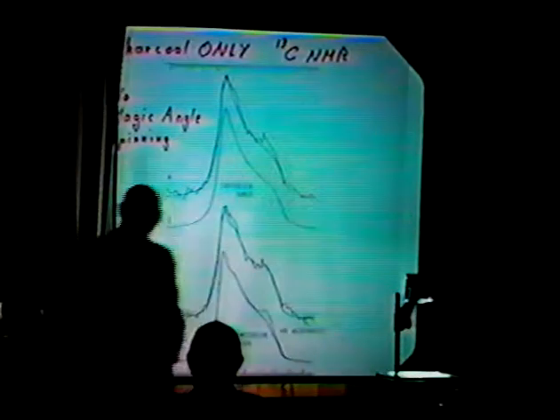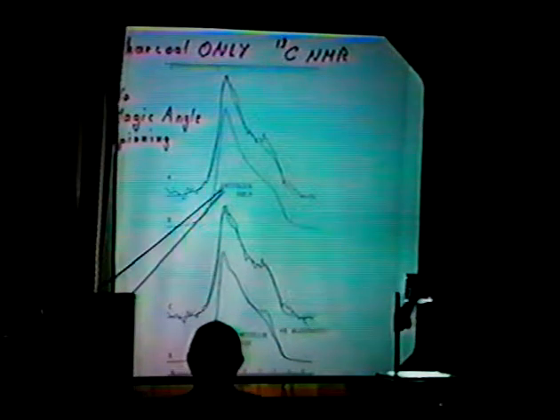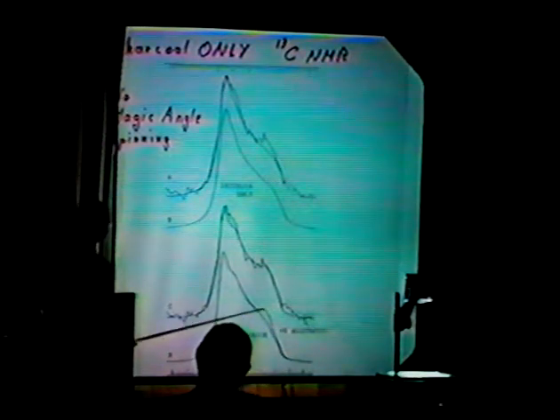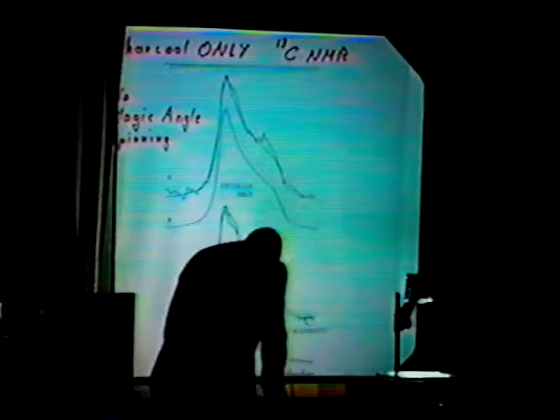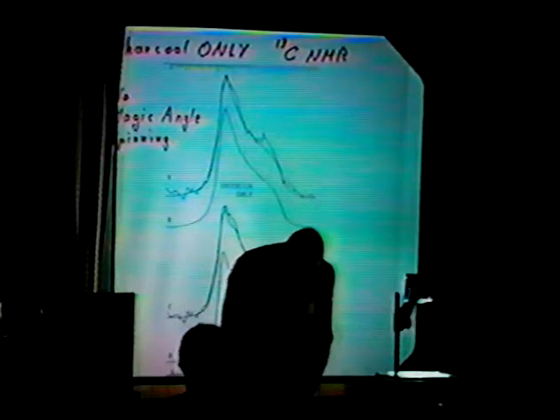If we said the carbons were interior only, or if we had 62% interior, 34% edge, and 4% aliphatic, both of these models fit the data equally well. But we hope to get better spectra and see if we can do a better job.